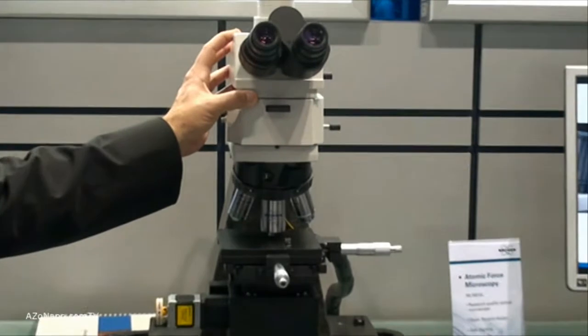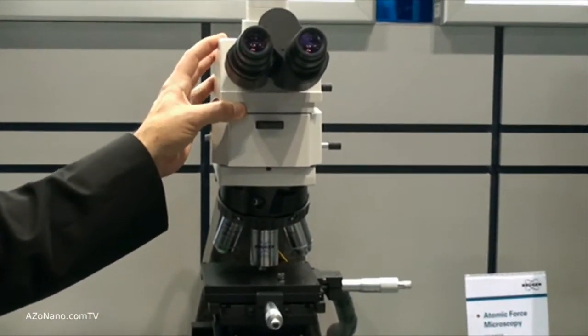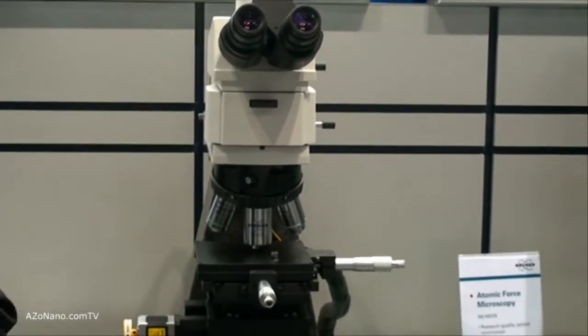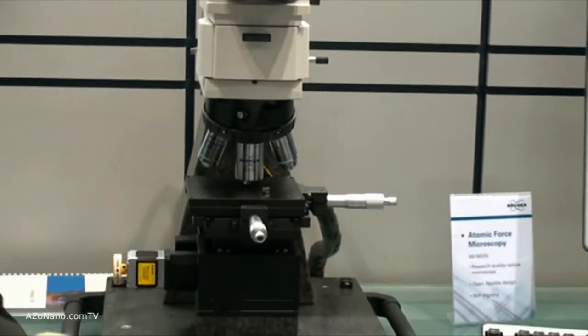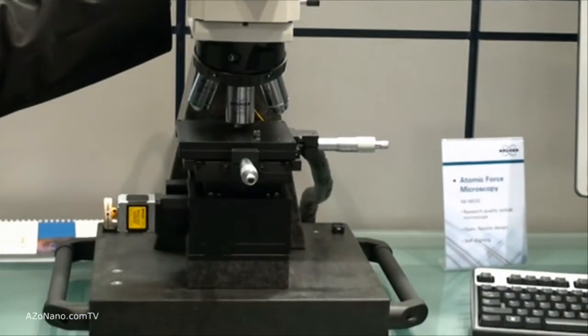We offer all the full modes: your scanning capacitance, your MFM, your EFM, all the standard scanning characteristics or capabilities we have.